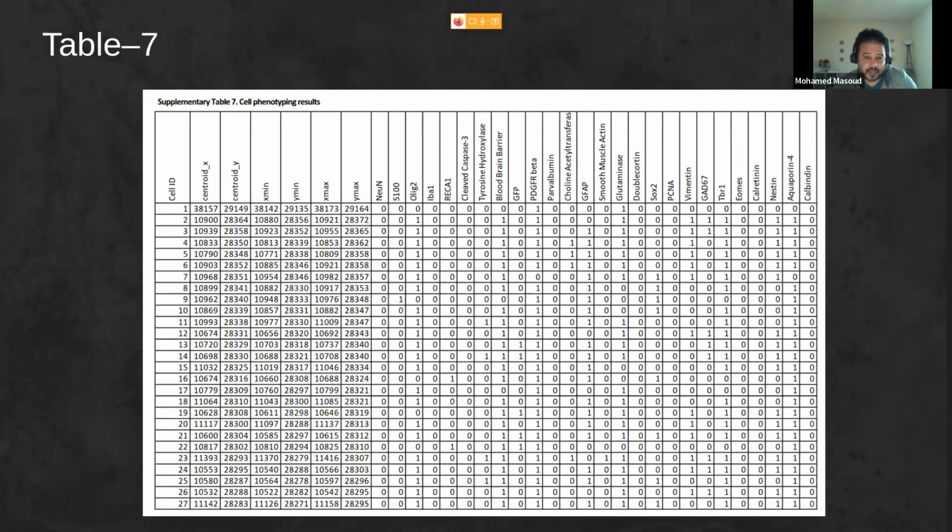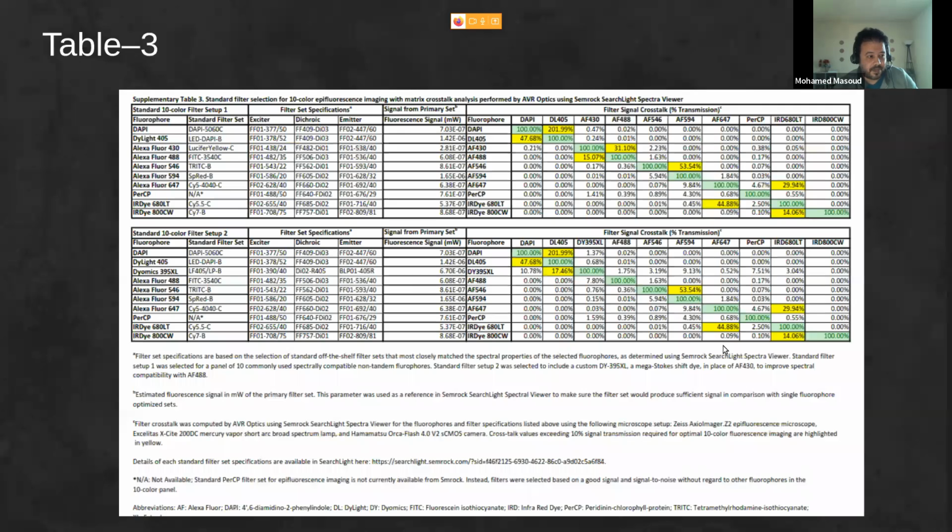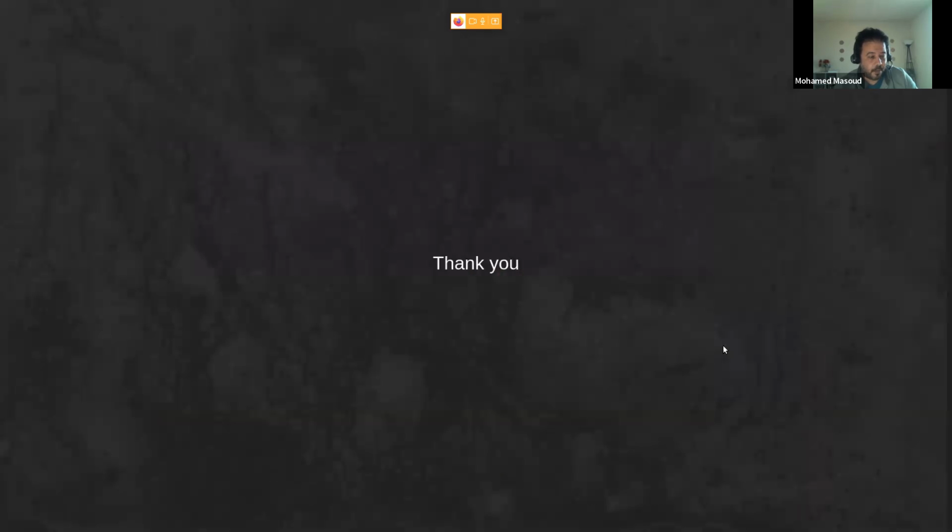And based on these coordinates and the cell type, we can know which cell has which neighbors, and from there we can do more analysis. So this is what they have up to that point.